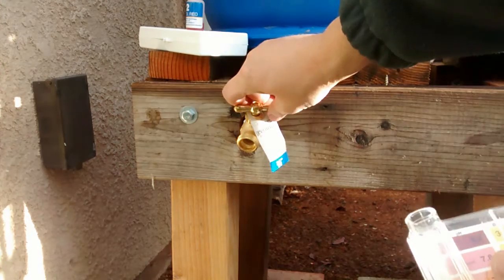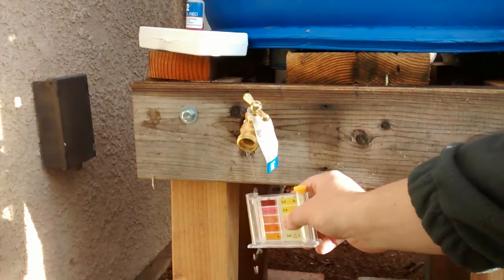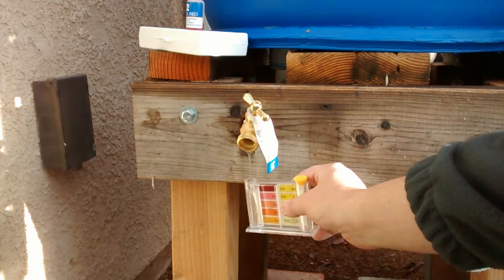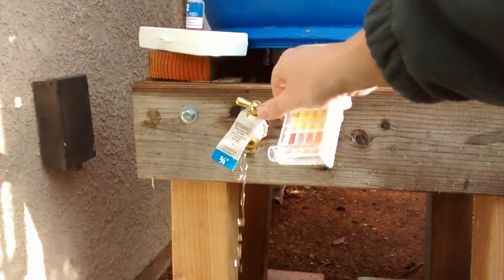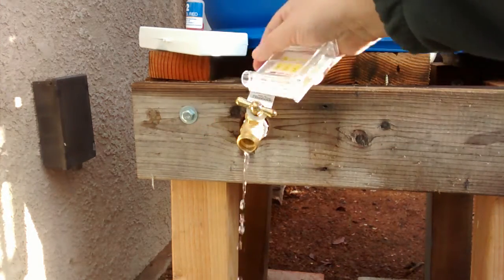What I'm going to do is first rinse. I'm going to rinse it first and dump it out a few times. Maybe there's some residual at the bottom of the barrel — residual dirt, debris and such.